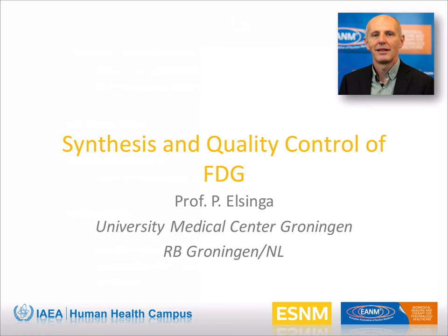This presentation teaches the production and quality control of the workhorse tracer of PET. This is 2-fluorine-18 fluorodeoxyglucose.